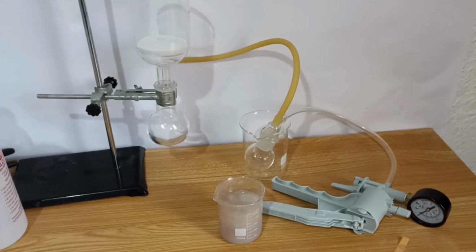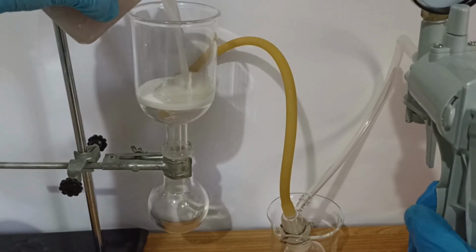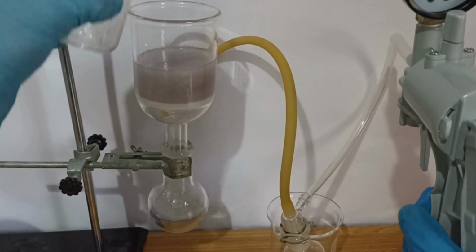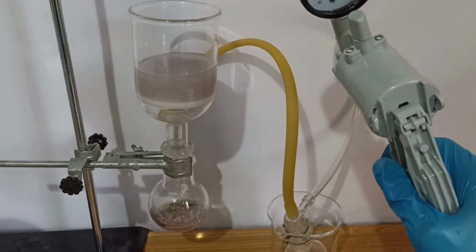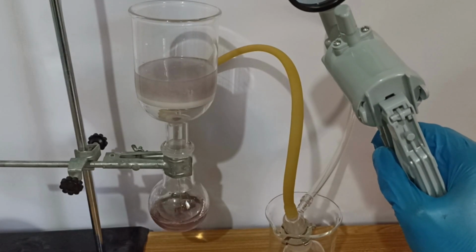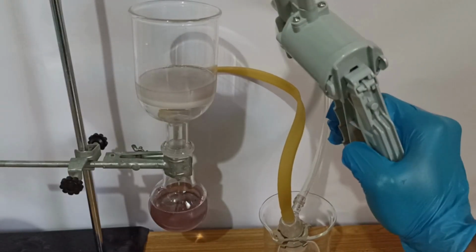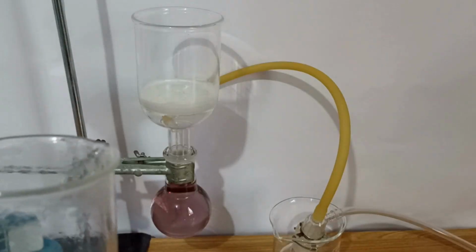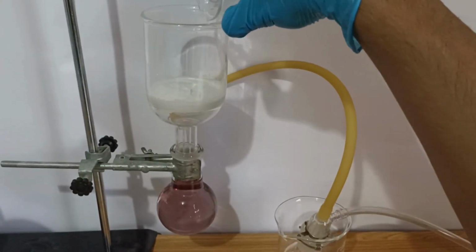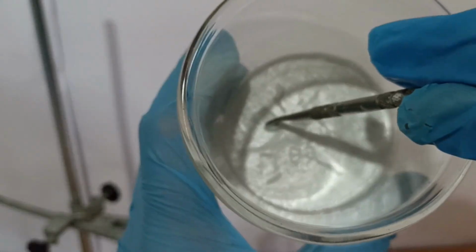I set up the vacuum filtration apparatus with my brand new vacuum pump. It's totally worth it. I really recommend getting one. As you can see, the filtrate is insanely purple. The beaker was rinsed with 10 more milliliters of water. Here you can see our crude phenytoin.